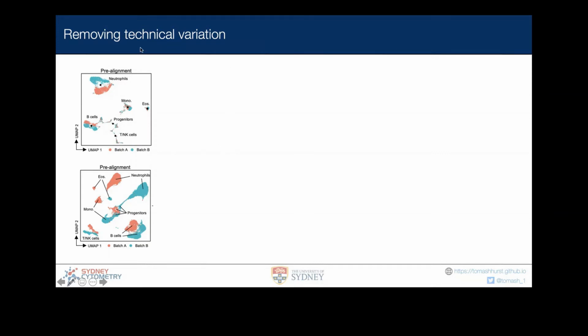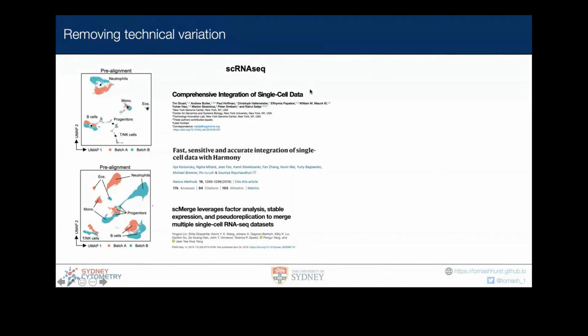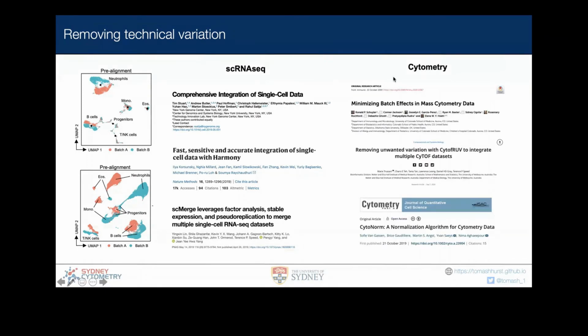So there are a few different approaches for doing this. The field of single-cell seq has got a whole range of them, and I think these have been driven largely by necessity because this has just purely been absolutely needed in this field. In cytometry, there's been quite a lot of development in this space as well, but I think not the same sort of range of options out there. But there are some options which we think are really quite good and in our testing have stood out from among the others. In particular, CytoNorm down the bottom here by Sophie van Gassen, who also wrote the FlowSOM algorithm. CytoNorm has kind of come out as our favorite way to do this, but there's a few other options which we've incorporated into our approach as well.